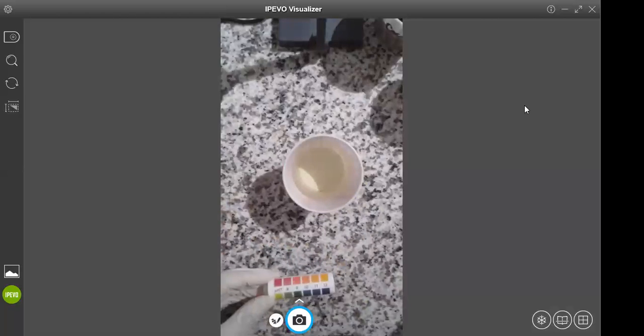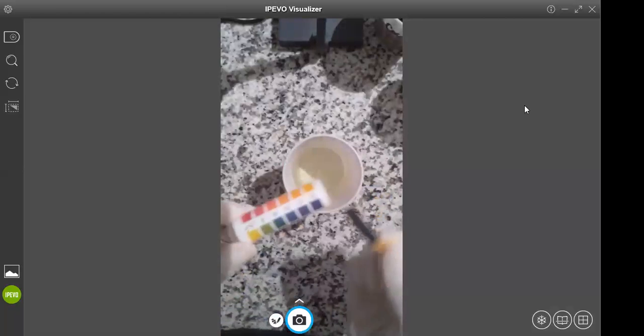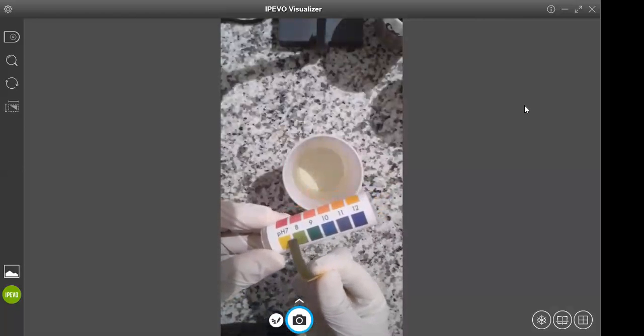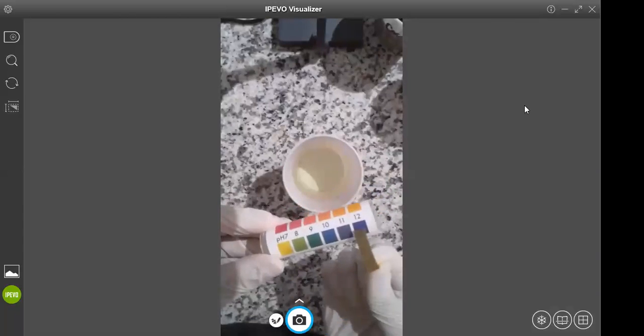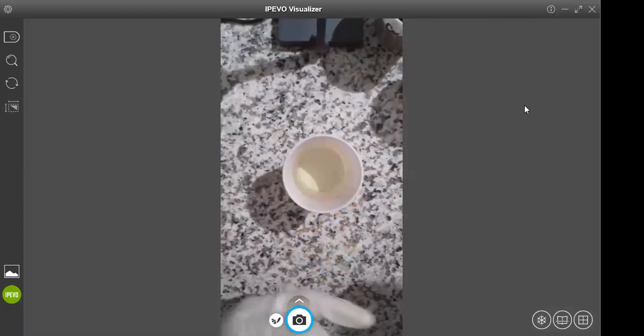So we're going to grab another strip just to see the initial color of the bleach. As you can see, the bleach is fading the color on the strip really fast. In case you haven't noticed, there's a reason I'm not even comparing it to the acidic side, because it's nowhere close to red.